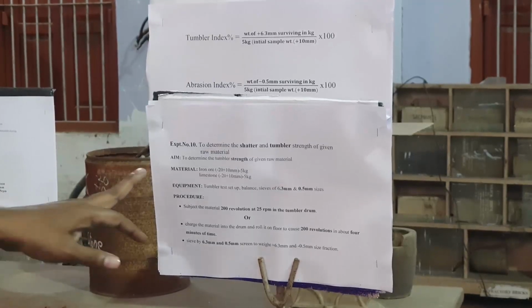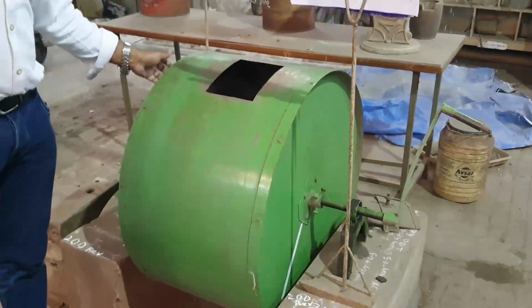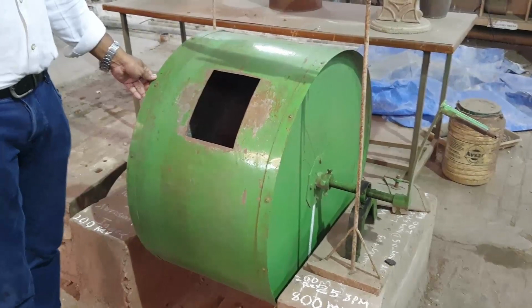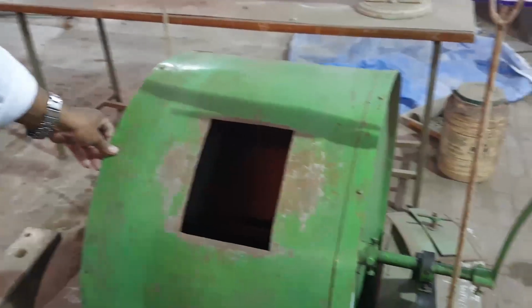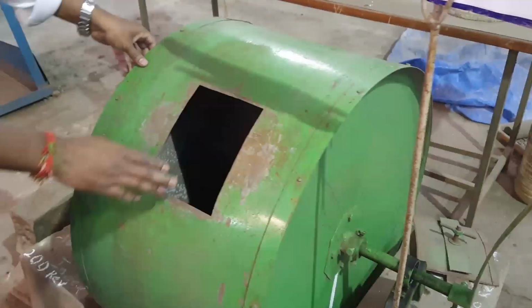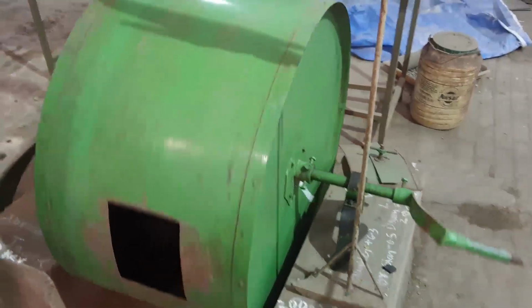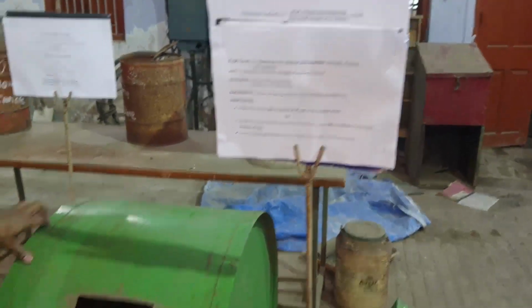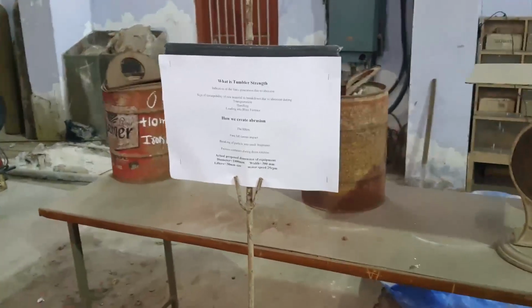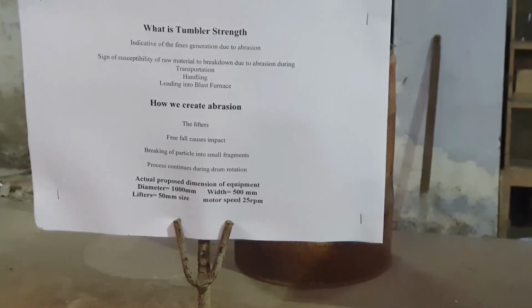So the procedure is, here this is the setup. You can see the drum. In this drum we are going to put the raw material. Here you can see the diameter and the width, and here we are putting the material. We have the provision to rotate this drum like this. The actual proposed dimension of the equipment: diameter is 1 meter, 1000 mm, and width will be 500 mm.